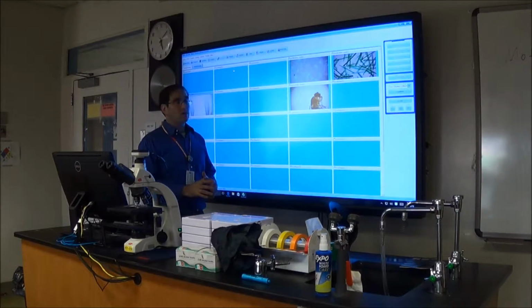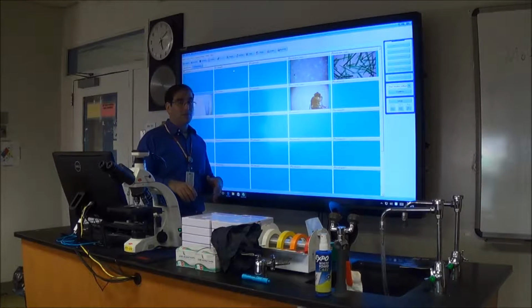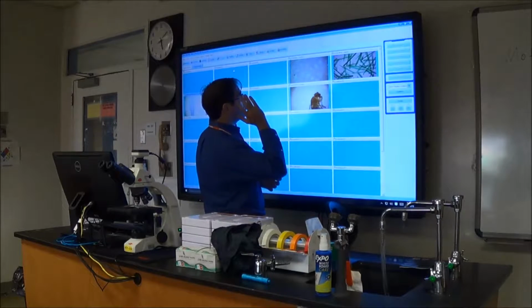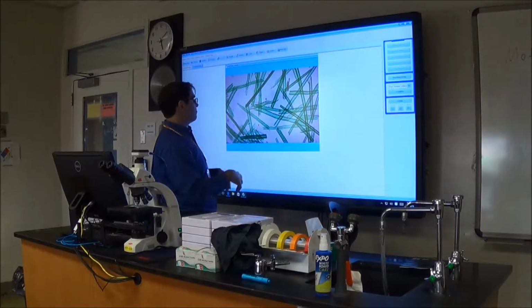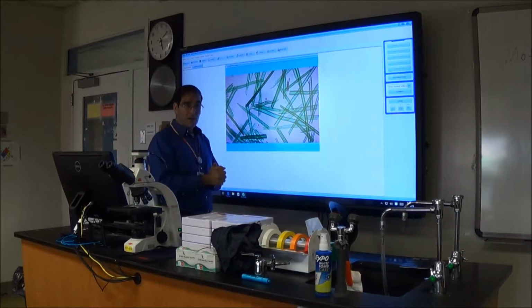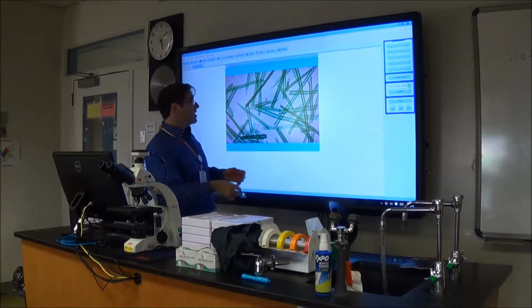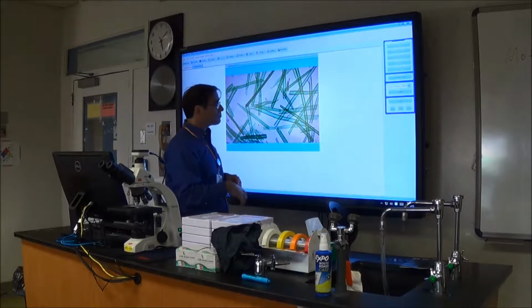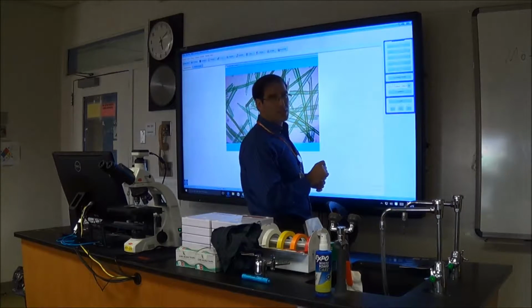Another option is what's called Teacher Demo. This allows you to send information out from your computer to their tablets and microscopes. So what I mean by that is, say you really thought that this was a great example that one of your students was doing, and you want to make sure that they can all see it and maybe they can use it for comparison. So this is a good example and you want them to be able to look and see something similar. So over here in the right corner, there's a tab called Teaching Demo.